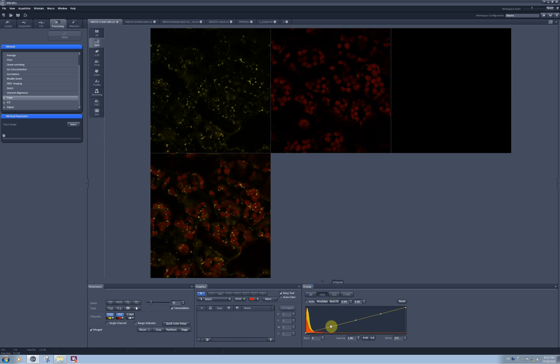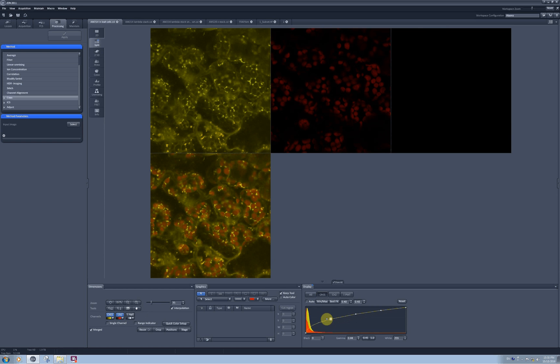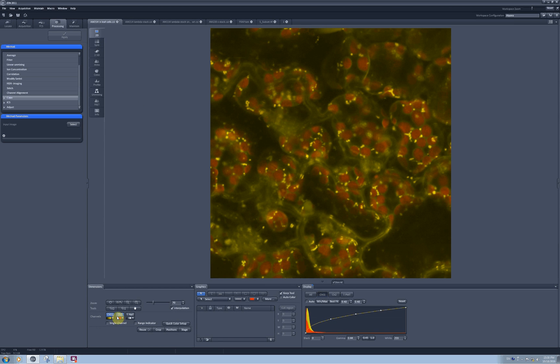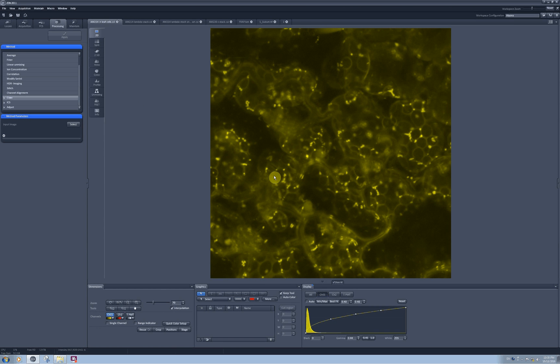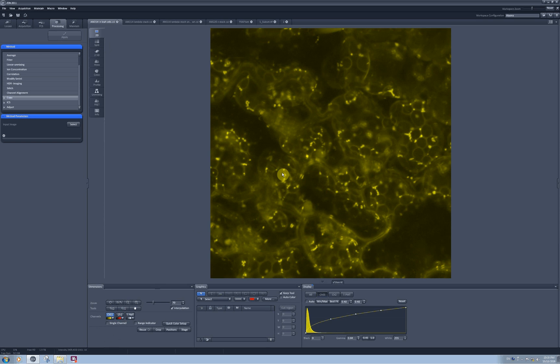I will pull up a little bit the YFP signal for you to be able to see that there was some signal in the places where I would expect to have only chloroplast present. This is most probably due to chlorophyll autofluorescence leaking into my yellow fluorescent protein channel.